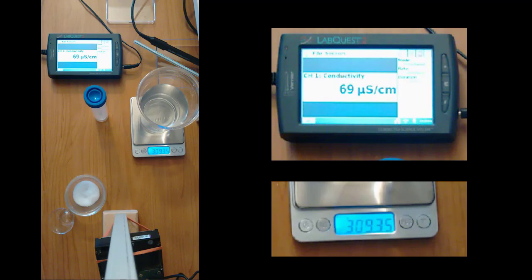So we have complete sets of data for tap water that's been filtered, and distilled water. I went through the data analysis and collection for the first trial, and it is your responsibility to crunch the numbers for the second two trials.